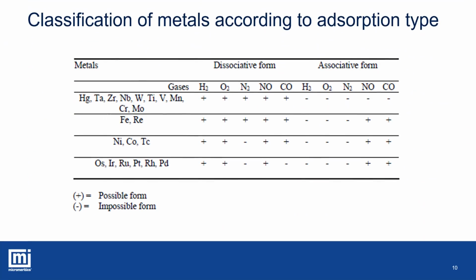Metals used in heterogeneous catalysts have affinity for some specific gas molecules. The most common adsorbates for metals are hydrogen, oxygen, carbon monoxide. We must remember that the analytical instruments measure the quantity of a probe gas chemisorbed or reacted with the metal. Thus, it is very important to know the precise stoichiometry of reaction if we need the quantification of the surface metal atoms. Generally, the stoichiometric factors should be related to the metal.